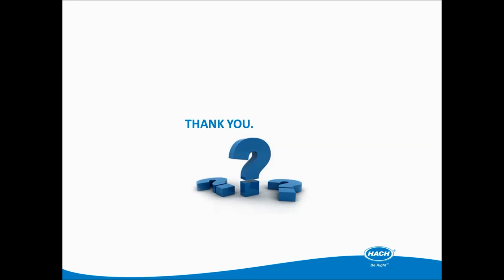Okay. What is the analysing time for a single analysis in your analyzer? And what is the frequency of the sample being tested on crude sewage? Again, you can adjust that in the analyzer. We would recommend for best response that the analyzer is set for its minimum time period, and that's one result every 5 minutes, but that can be increased if you so wish.